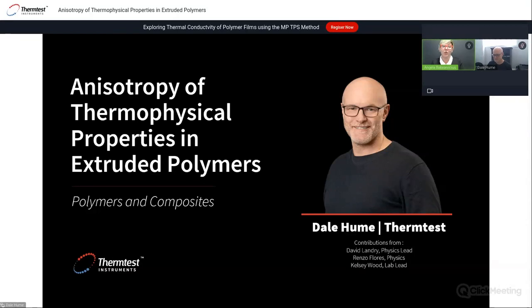So in this upcoming webinar, we will delve into the fascinating subject of anisotropic thermal properties in extruded polymers. We'll explore how the modified transient plane source, MTPS sensor, can be utilized to measure these properties accurately. This session aims to provide valuable insight into the capabilities of the MTPS method for future research and thermophysical analysis.